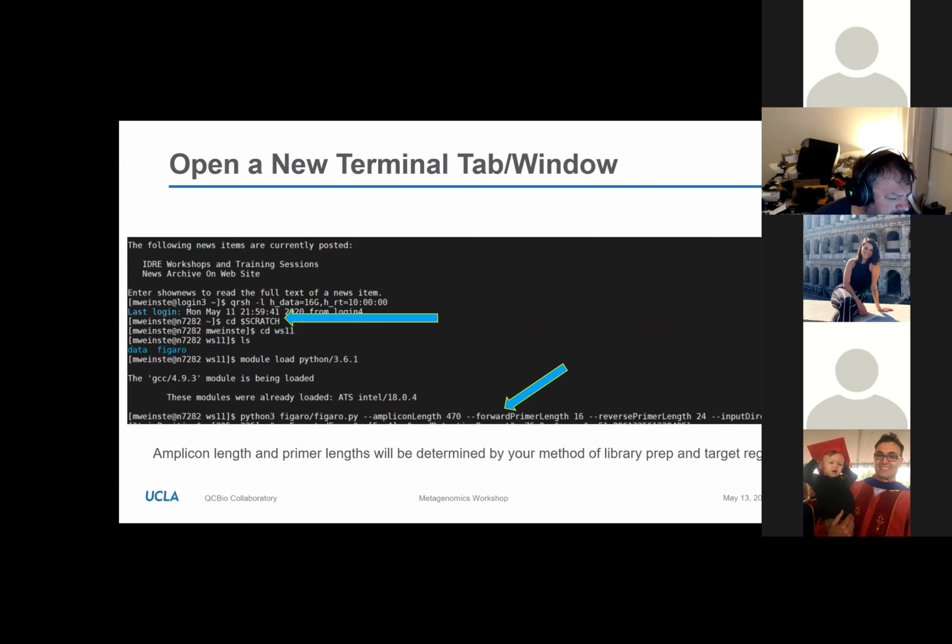All right, so Ava, oh, you're typing in part of my command prompt there. Oh, I totally am. Thanks. No problem. Yeah, so cd WS11 should be what does the trick.